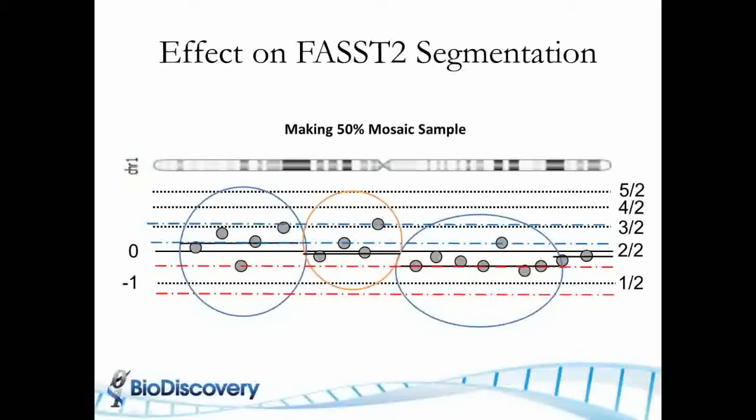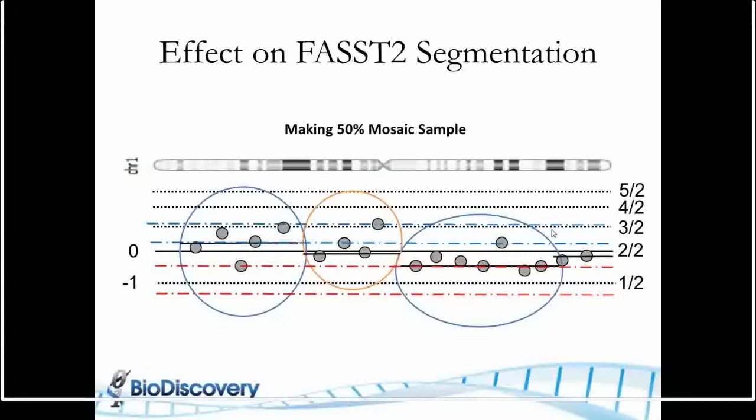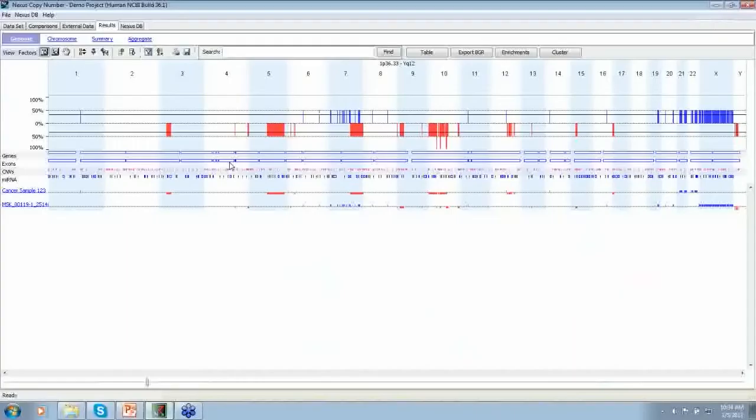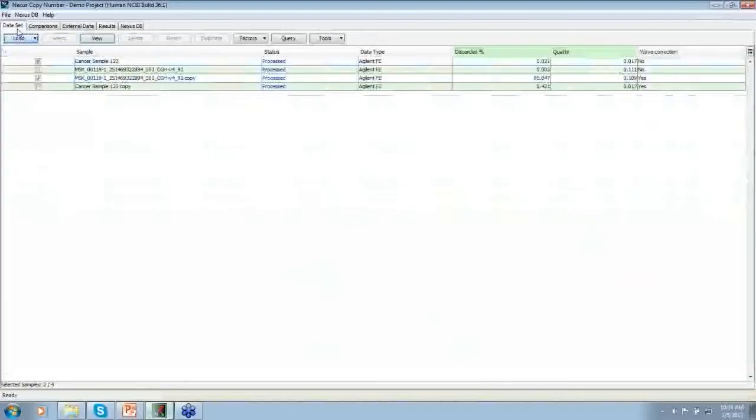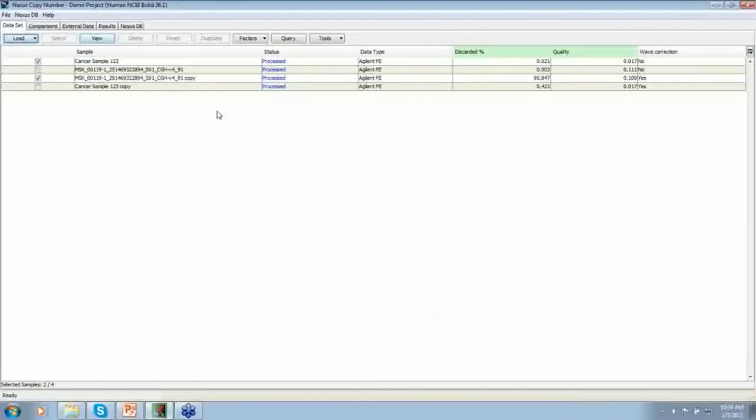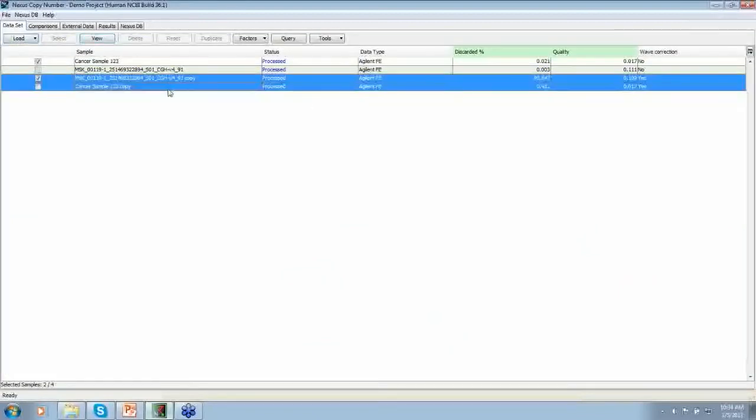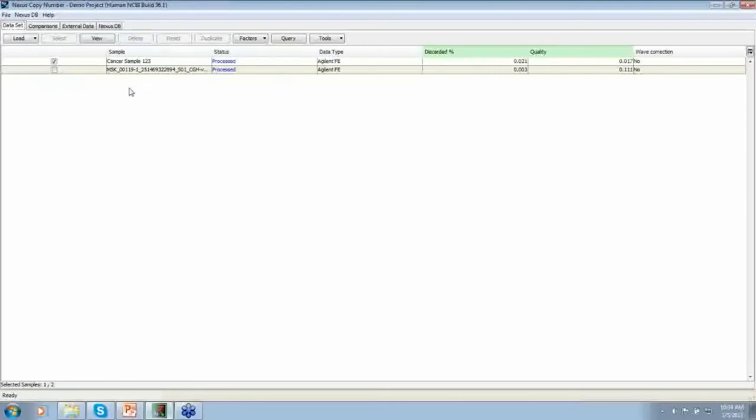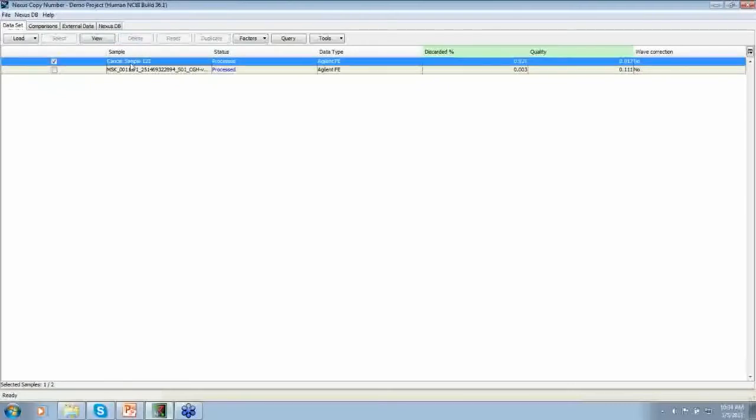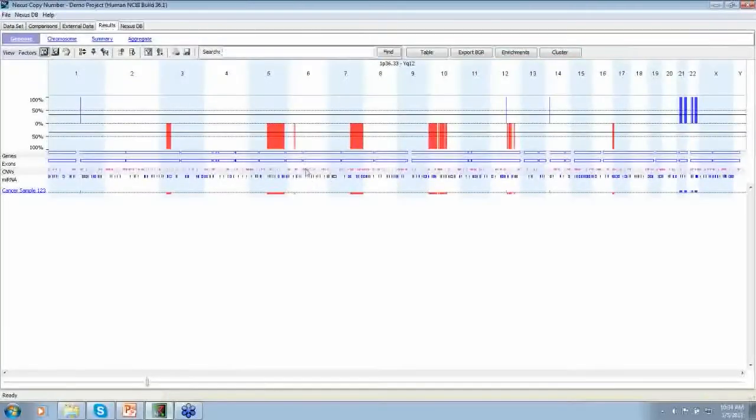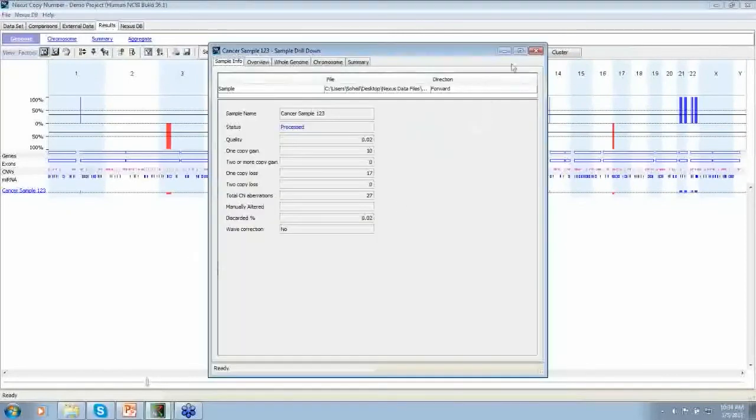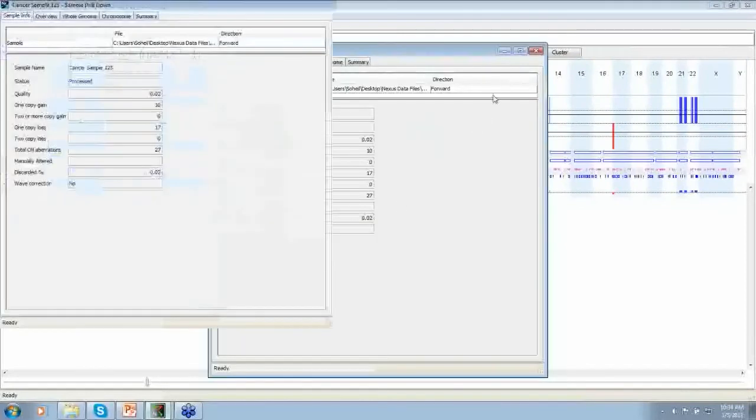So to show you that, let me go now into Nexus and the dataset tab and delete these two samples and start. Let's just view this one sample and talk about that in detail.